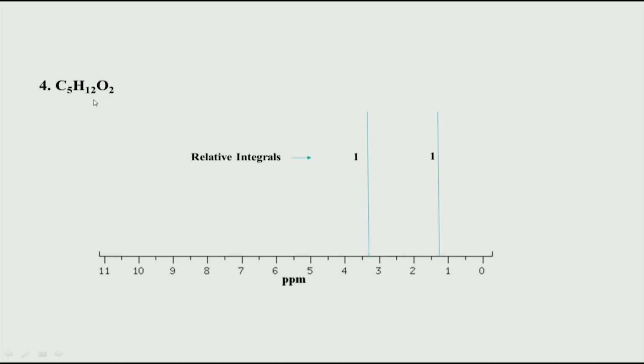Now, there are 2 oxygens remaining here. So, how do we interpret those 2 oxygens? Look at this value, it is somewhat downfield shifted. If this is a methyl peak, remember we said a methyl peak always comes between 0 and 2 if the carbon of the methyl is not attached to any oxygen. But if the carbon of the methyl is attached to an oxygen, then it comes here, and that is called a methoxy. So, a methoxy group is OCH3.